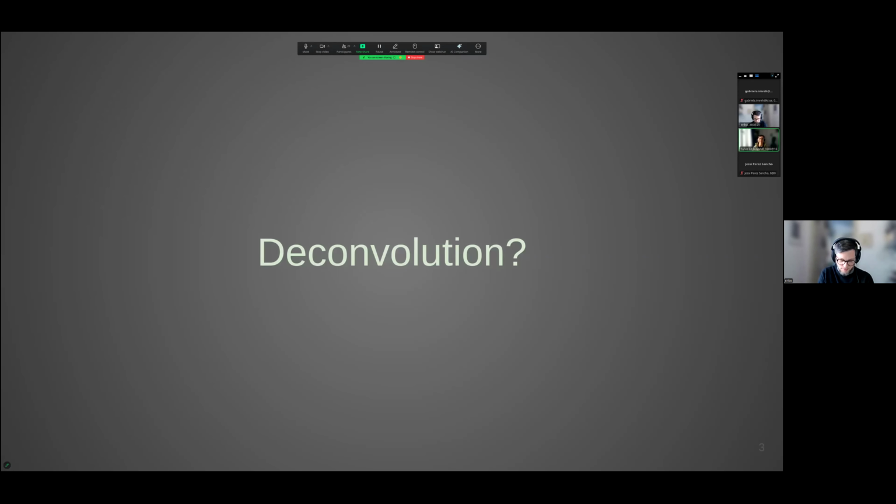So, back on track. What is deconvolution? Most likely you have seen what it is. You've seen some pretty examples. But after this lecture, I hope that you will appreciate it as something that is not just a prettification filter, but something more. I will try to give you a conceptual idea about what it is and point to some possible issues or problems with the technique.